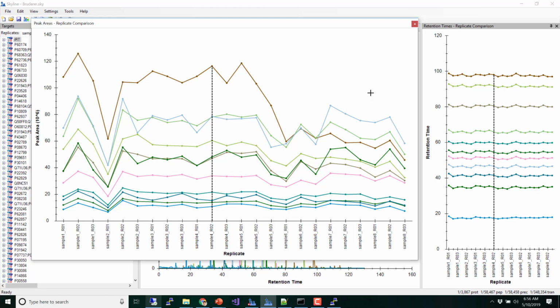This is where you talk to a statistician before you collect the data, because you can't show up at a statistician and say, this is the order I collected them in. What they want is for you to block so that you collect all your replicate ones together, then all your replicate twos together, then all your replicate threes together, so that you have a full experiment. So if something goes wrong, you just throw out that whole block, right?